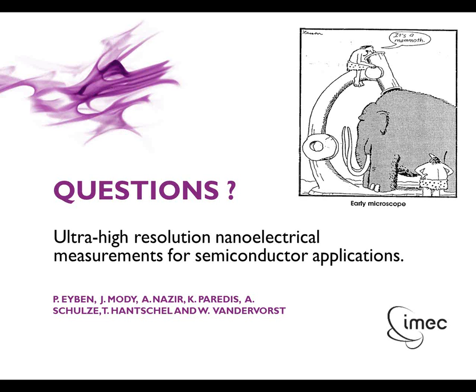And also, it's nice to identify the different materials, rather than to go to very nice resolution mapping, but to really identify the kinds of material that you have. For instance, we have some examples which I think will be published soon by Ravi Shintala, who is working on this on our side here at IMEC, where we have been using KPFM to identify PCBM and P3HT before doing CFM mapping.